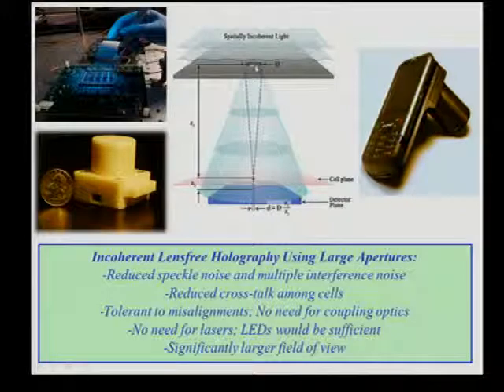The second important thing is that the spatial coherence here is not as important. We typically work with a gap between an aperture plane and the sample plane that is a few centimeters, dictated by this tube length. That gives us sufficient spatial coherence at the object and detector plane so that almost diffraction-limited information in terms of the scattered field can be acquired or sampled at the detector plane. And this diameter here, the aperture, is very large in our case.